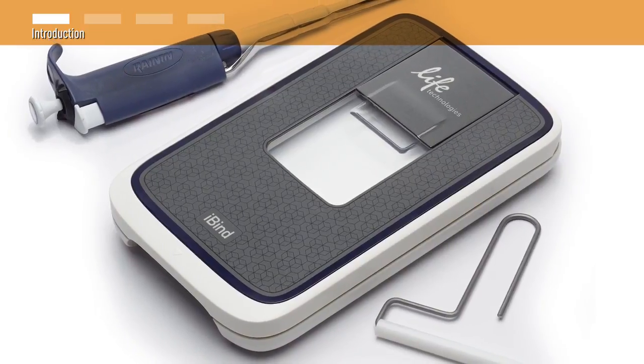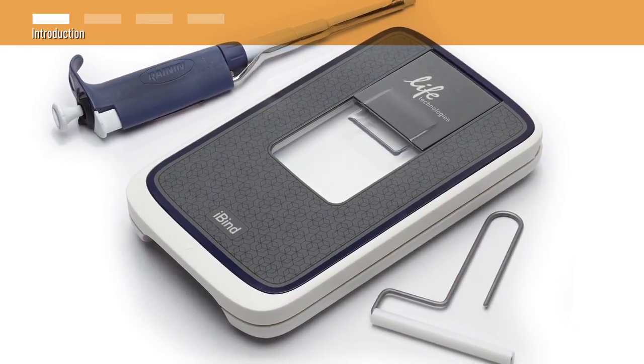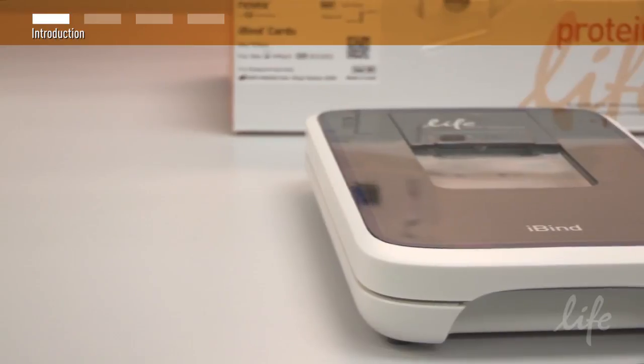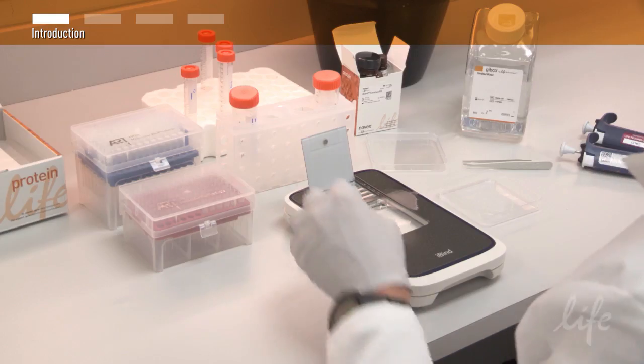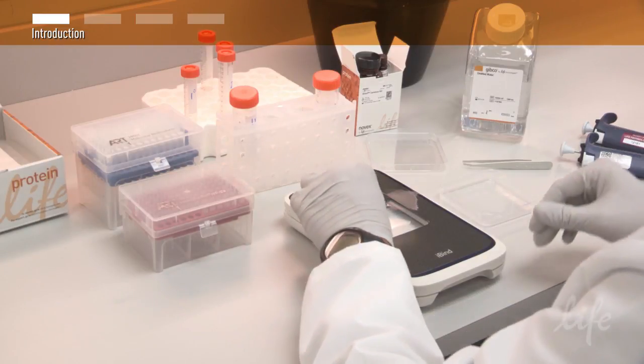The iBind Western system performs all immunodetection steps in a seamless sequential process. Blocking, primary antibody, secondary antibody, and wash steps are sequentially automated in a fully walk-away technique.